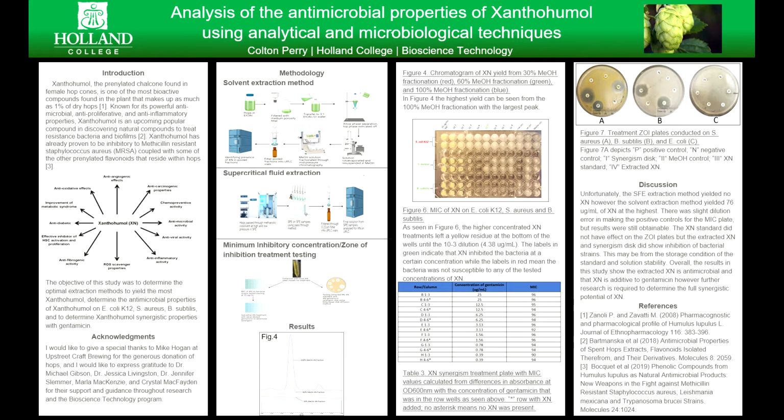On the microbiological side of this testing, I conducted both MIC, minimum inhibitory concentration, and zone of inhibition, with an additive study of the synergism testing with gentamicin and xanthohumol.